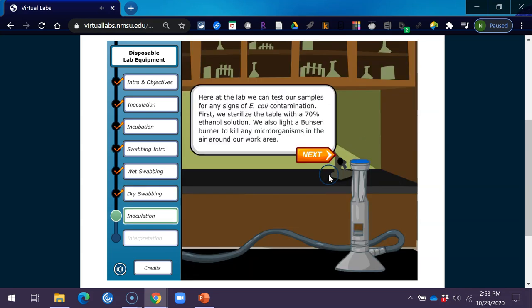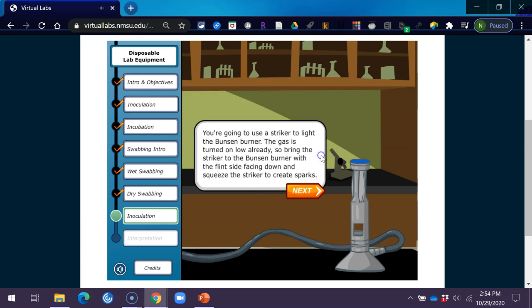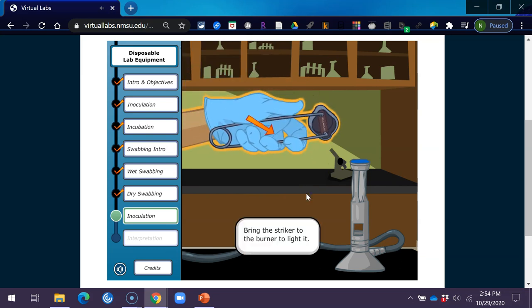Here at the lab, we can test our samples for any signs of E. coli contamination. First, we sterilize the table with a 70% ethanol solution. We also light a Bunsen burner to kill any microorganisms in the air around our work area. Use a striker to light the Bunsen burner — the gas is turned on low already. Bring the striker to the Bunsen burner with the flint side facing down and squeeze to create sparks, then bring it to the burner to light it.